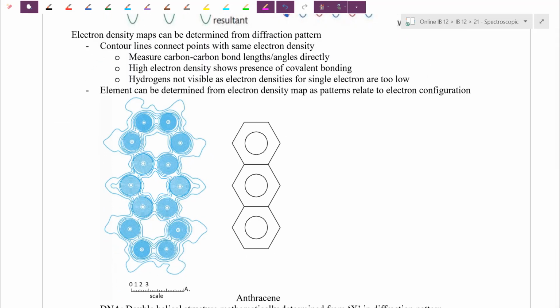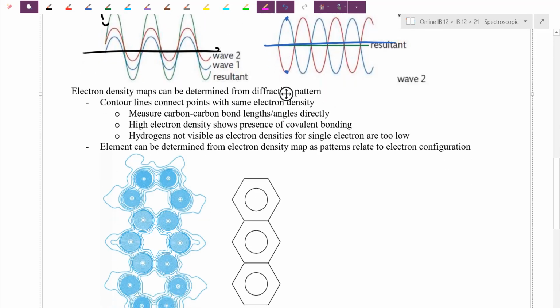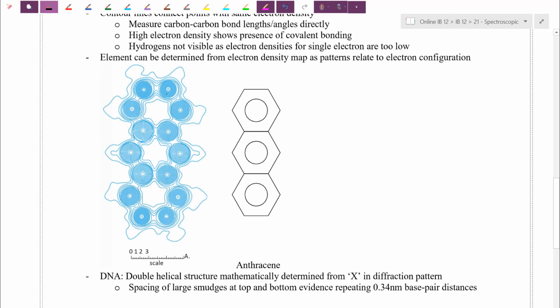They took the molecule anthracene. It's the first molecule we're seeing that has fused rings. Like benzene, it has that electron delocalization. They've done this X-ray crystallography on a sample of anthracene, and this is the shadowy pattern that was left behind by the anthracene sample.